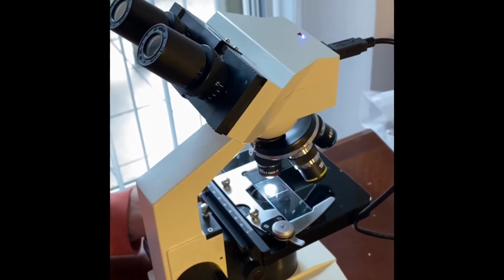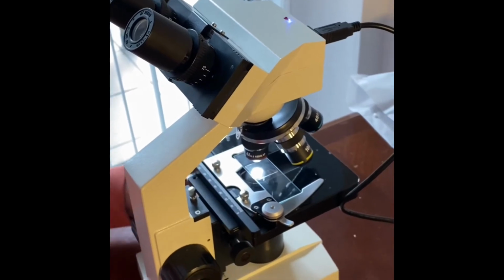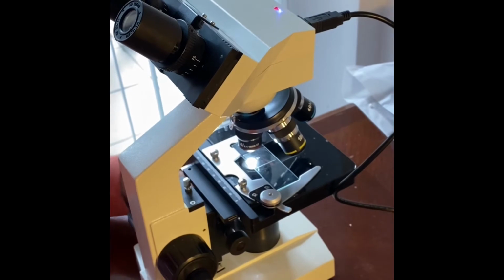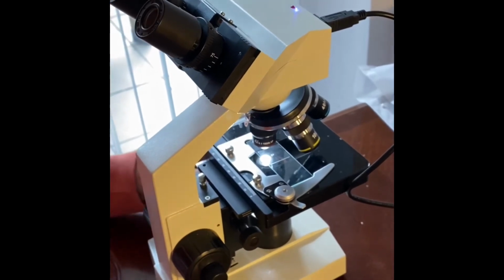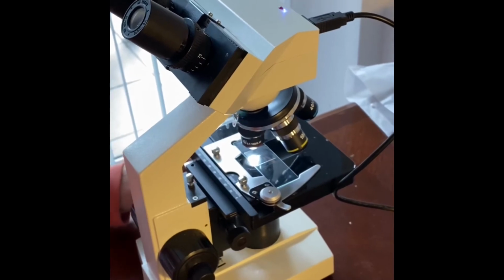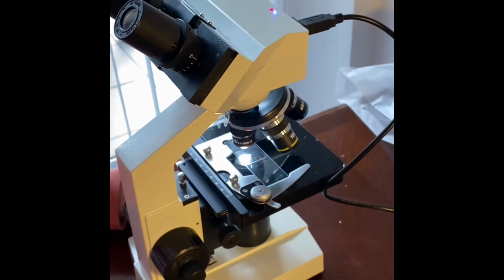Use the adjustment to move the specimen to where you want to see it. The one on the top goes up and down, and the one on the bottom goes from left to right.